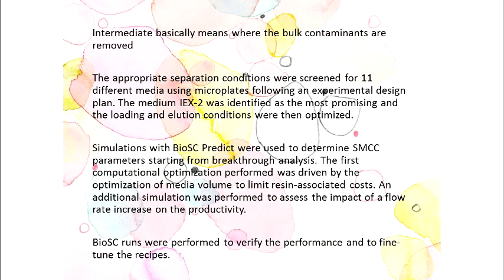And the simulations by BioSC Predict were used to determine the SMCC parameters, starting from the breakthrough analysis. The computational optimization performed was driven by the optimization of media and also limited to resin-associated costs. And BioSC runs were also performed to verify the performance and to fine-tune the recipes.